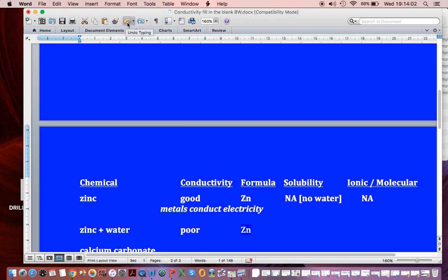So our formula is still zinc. And it did not dissolve at all. And again, it doesn't really apply.